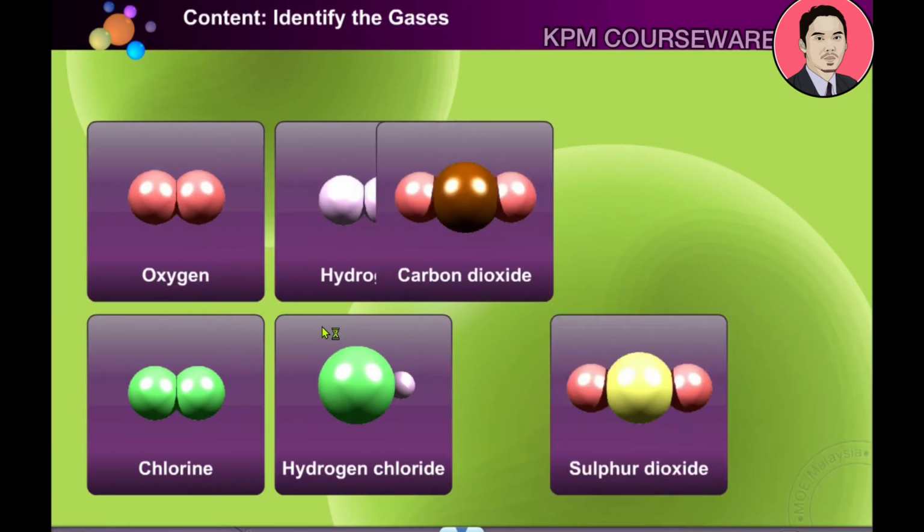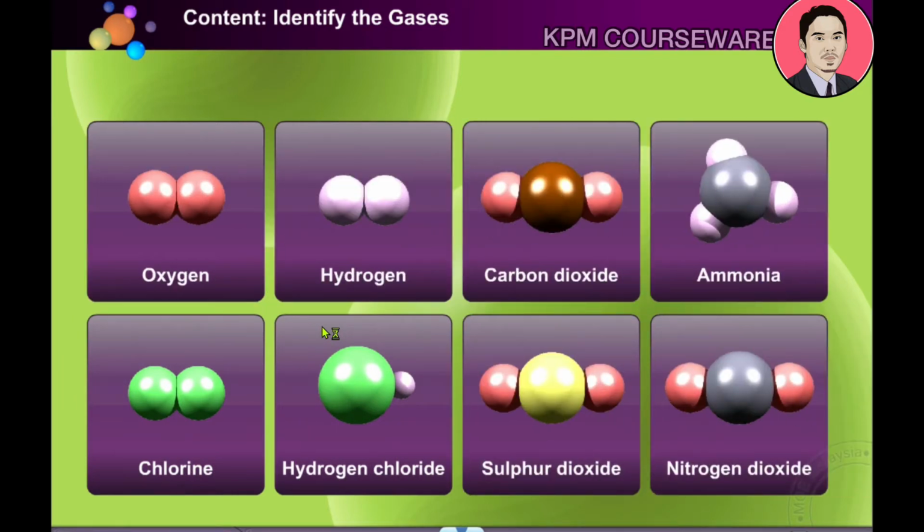These are the gases liberated during chemical tests carried out on salts. How do we identify these gases? What are the confirmatory tests for these gases? Click on the gas to find out.